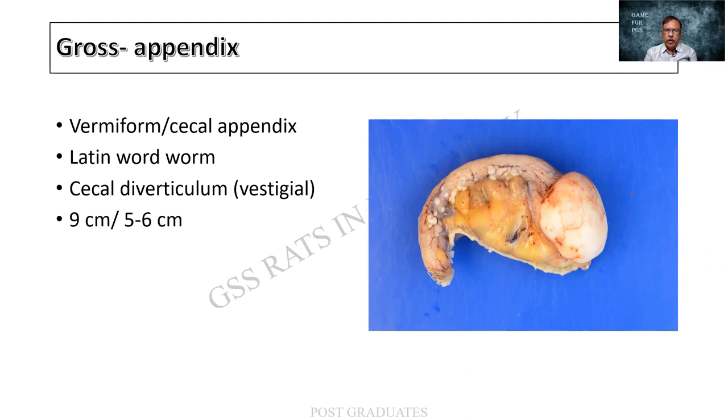In this case, it is too obvious, and therefore nobody will be making a mistake. Also look for multiple nodules like this. These can be tubercles, or there can be metastatic tumor deposits, or an inflammatory exudate itself. This has to be studied and ruled out.